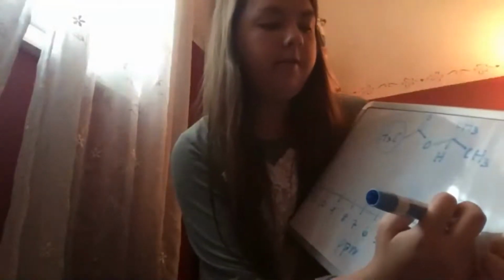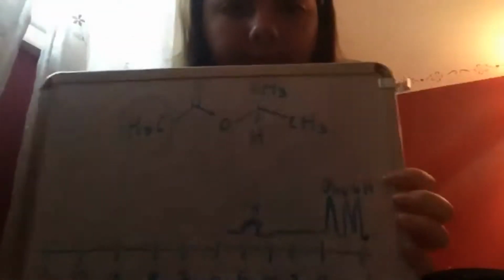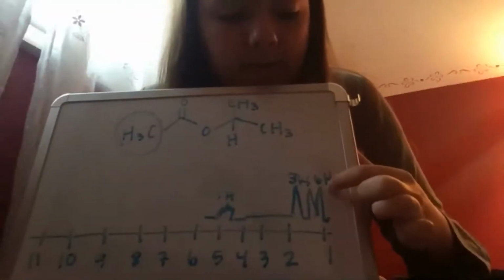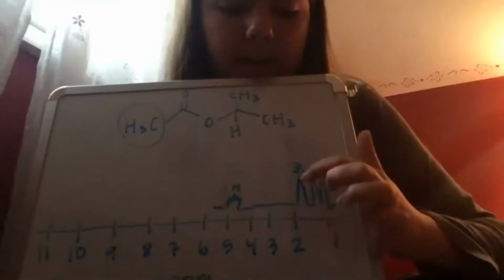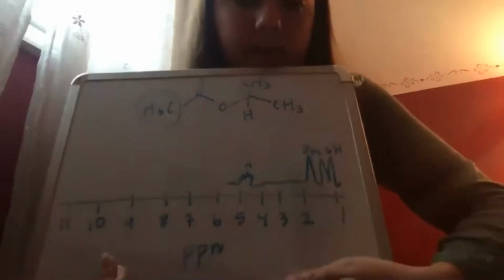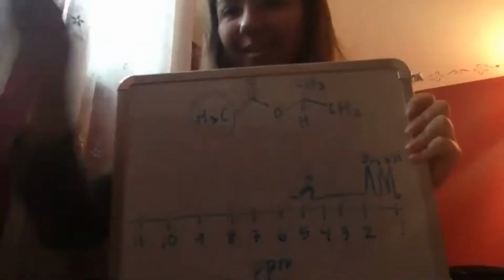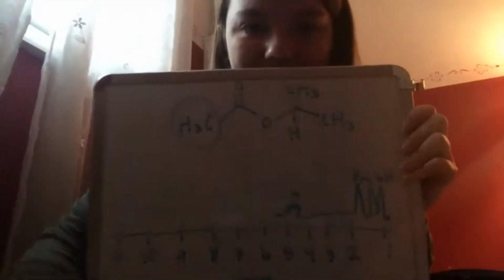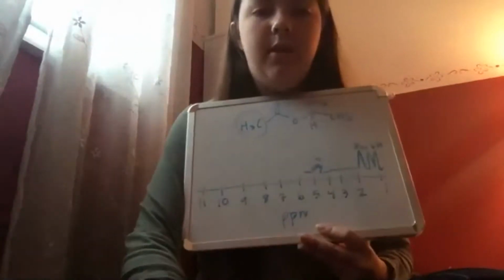Let me draw it and I'll show you. Again, it's kind of clustered, but if you look, I did 6 hydrogens right over here, around 1.5, because 2 doublet peaks that are the same height as this 3 would equal about 6. And then I have this chemical shift in this one. So this is what it would look like roughly. Obviously, this is not the best, but you can kind of see what it would look like. So that's how you draw it.